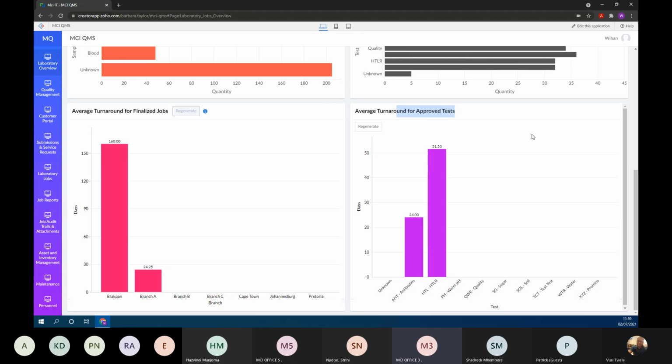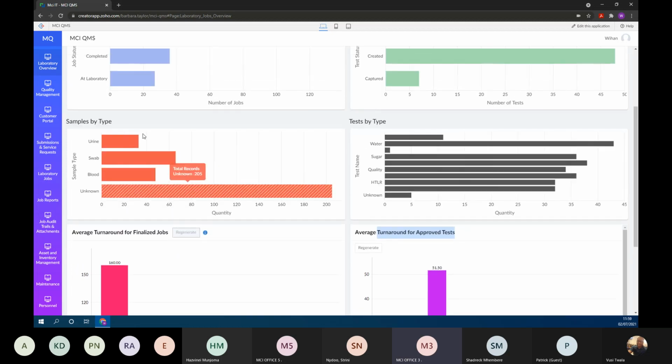And the way in which the system achieves that is to automate and enforce the workflow and all the functions that each user has to perform to maintain that flow. And if they don't, then that's where their dashboard starts filling up. So if there are such bottlenecks, they can immediately be traced.